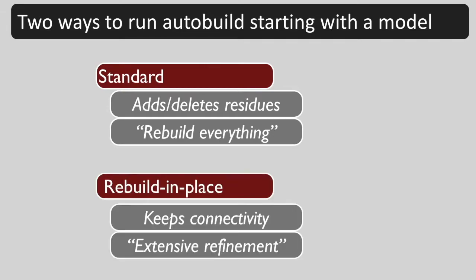Alternatively, we can just move the residues in this model around. This is called rebuild in place because the model is rebuilt where it is with no changes in connectivity. You can think of it as extensive refinement.